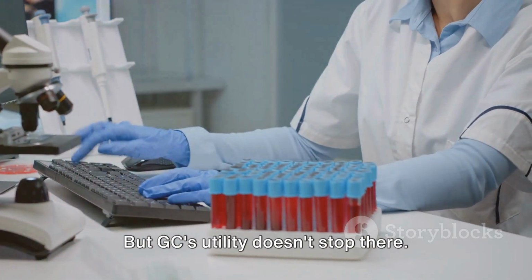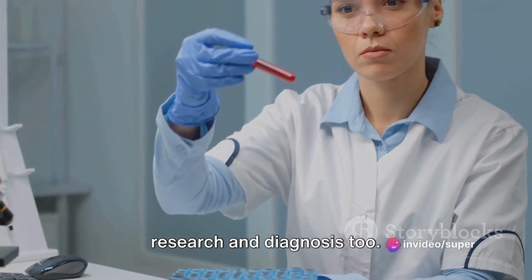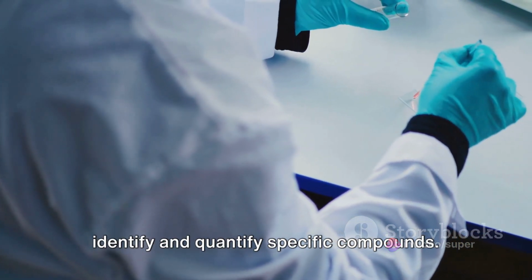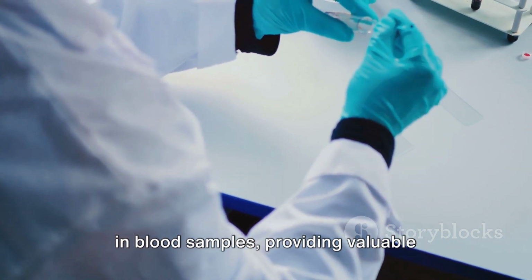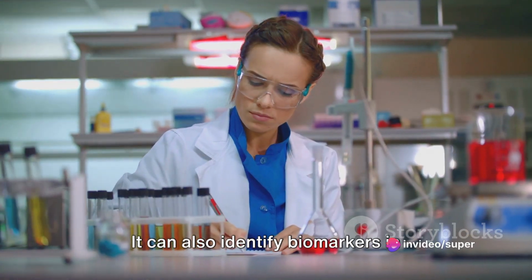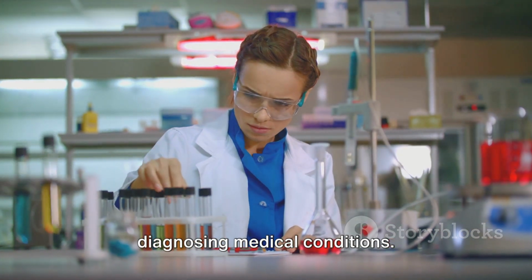But GC's utility doesn't stop there. It has a significant role in medical research and diagnosis too. It's used in the analysis of biological samples such as blood or urine to identify and quantify specific compounds. For example, GC can analyze fatty acids in blood samples, providing valuable information about a person's nutrition and metabolism. It can also identify biomarkers in disease, providing crucial clues for diagnosing medical conditions.